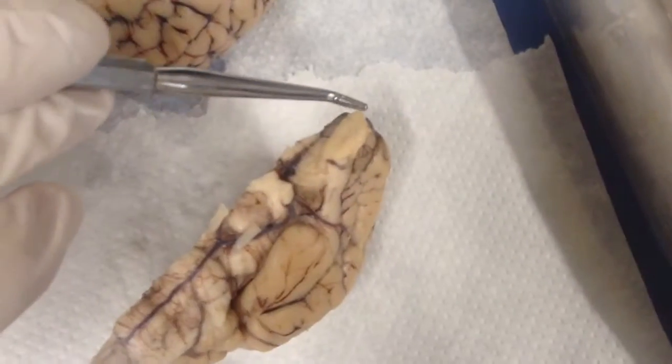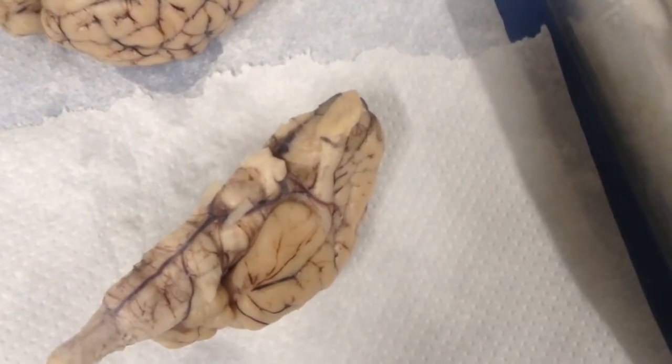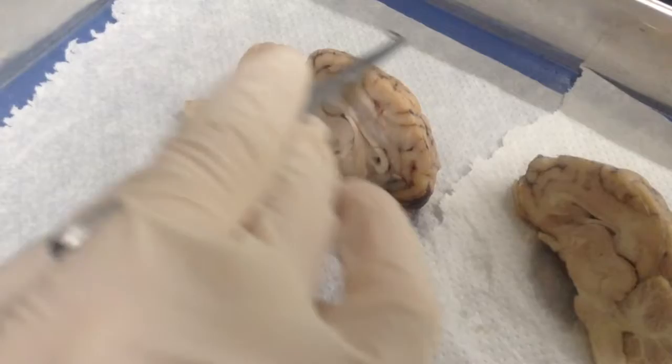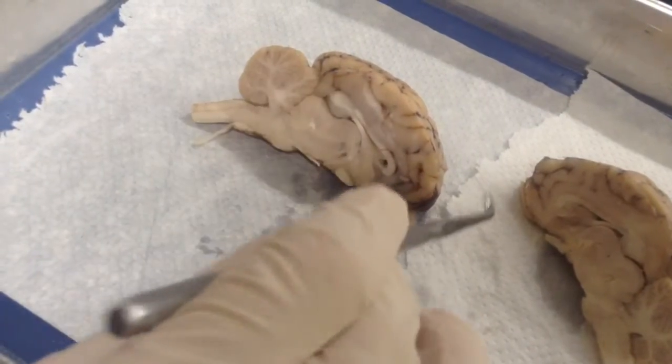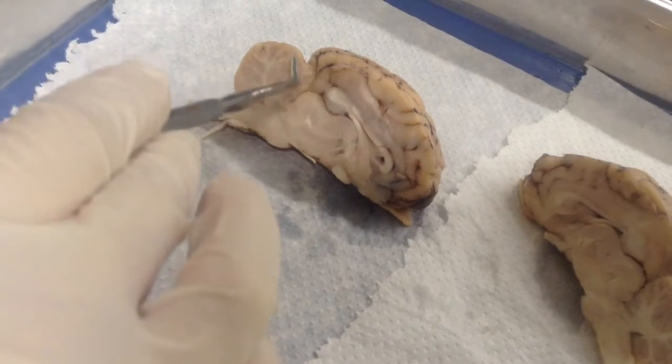So this is one of the two olfactory bulbs, and its function is to process senses such as smell. So the cerebrum is right here, and this is the main part of the brain. The cerebellum is the part of the brain that extends posteriorly.